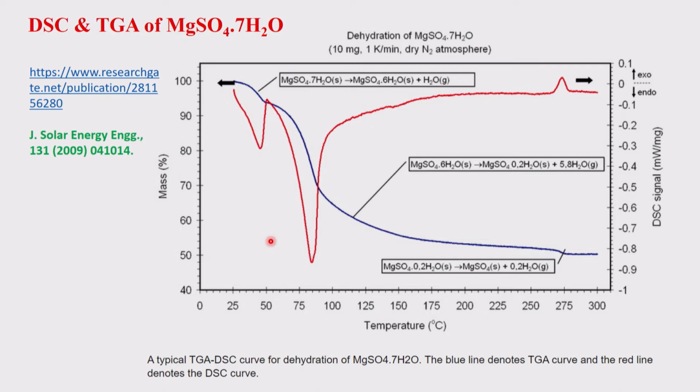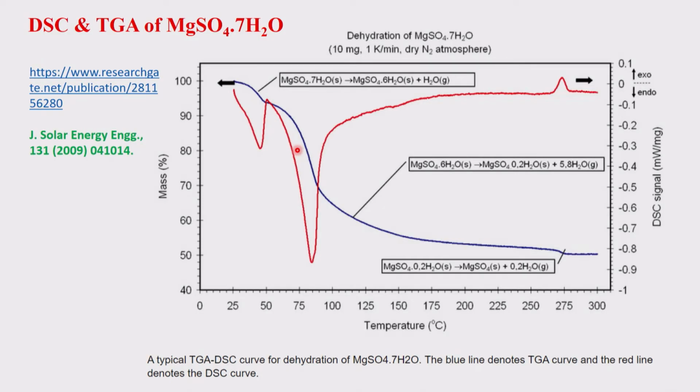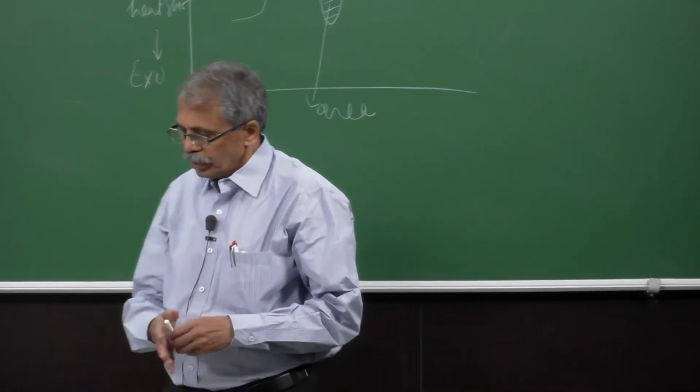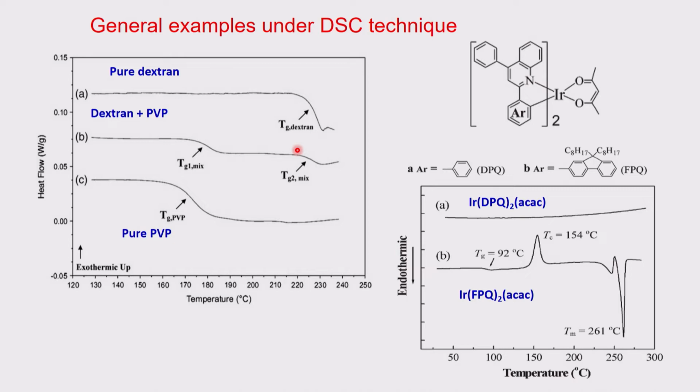So, in future when you have a mixture, you can use this signature to identify it from the mixture. I have already shown you from TGA how you can identify the mixture. So, here from the DSC also you can identify the mixtures. I was talking to you about when you have a mixture. Yes, there is an example given here, but for a different sample.